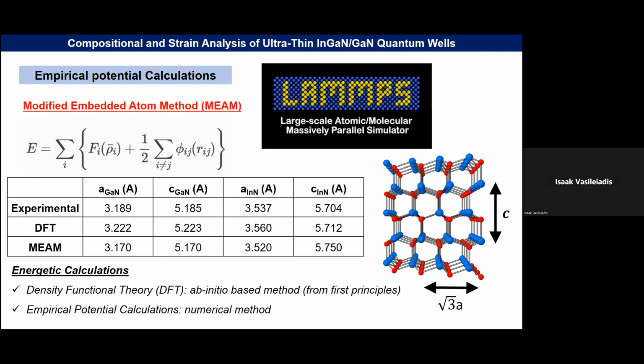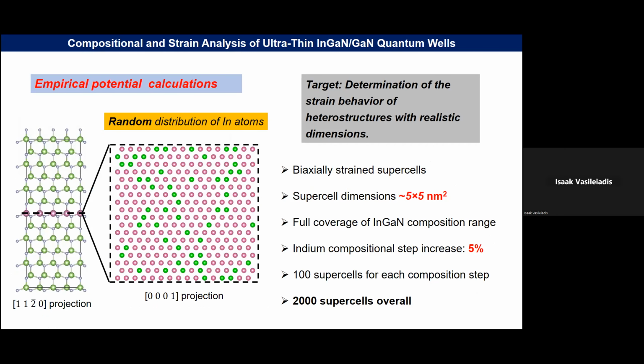And the next step is to model structures that cover all the cases you can find.